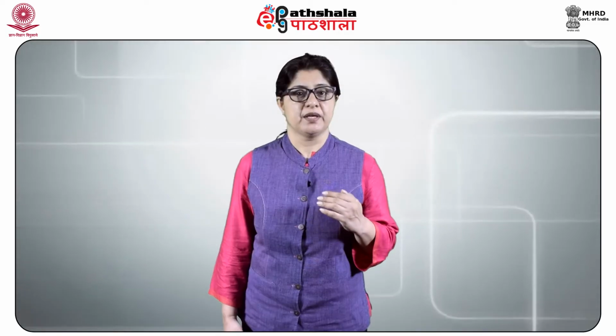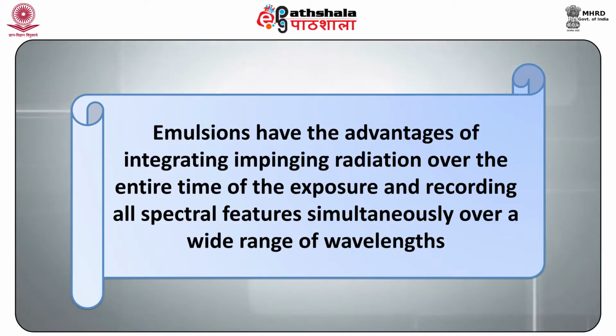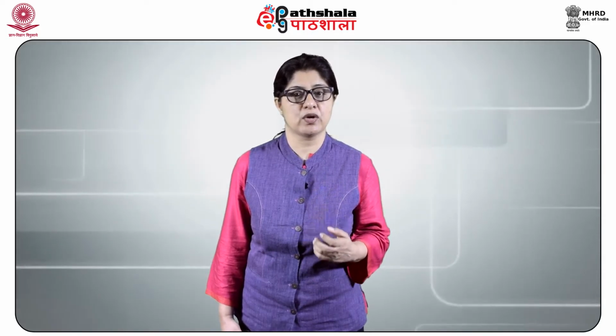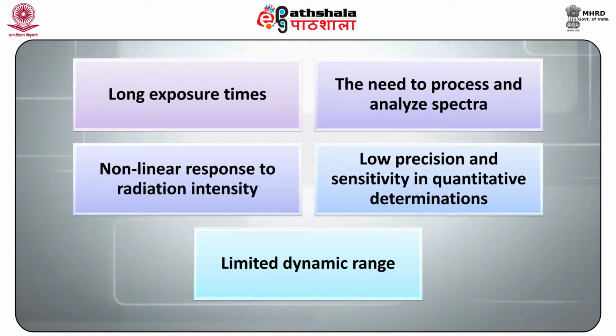Detectors and readout devices. Detectors used in emission instrument systems fall into two categories: photographic emulsions and photoelectric transducers. Most recently, mass spectrometers are being used as detectors for ICP sources. Emulsions have the advantage of integrating impinging radiation over the entire time of exposure and recording all spectral features simultaneously over a wide range of wavelengths. These characteristics allow weak spectral lines to be detected by using long exposure times, and they also provide a relatively inexpensive means of obtaining permanent records of emission spectra. Limitations of emulsions are long exposure times, the need to process and analyze the spectra, non-linear response to radiation intensity, low precision and sensitivity in quantitative determinations, and limited dynamic range.